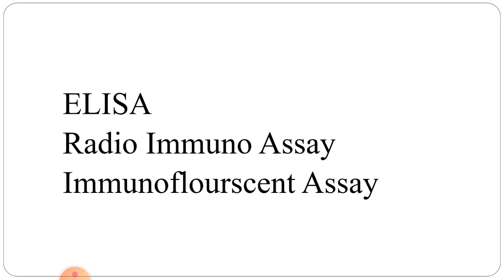Immunological techniques. Here there are major types of immunological techniques to be discussed: ELISA, radioimmunoassay, and immunofluorescent assay. In today's class I will be discussing ELISA.